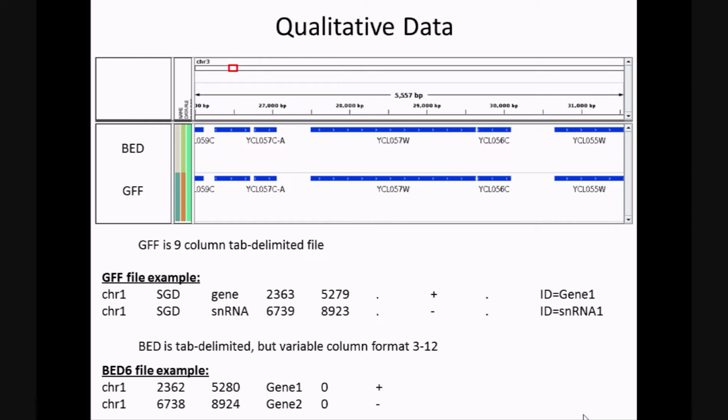If you will be working with GFF and BED files, it is important to know that BED files use a zero-based coordinate system, while GFF uses a one-based system. This means that nucleotide 1 is actually nucleotide 0 in a BED file. Additionally, the stop coordinate in a BED file is exclusive, meaning that the annotation stops at the stop coordinate minus 1. Please take a moment to look at the start and stop coordinates that I have highlighted here. Though the numbers differ, they do refer to the exact same annotations.